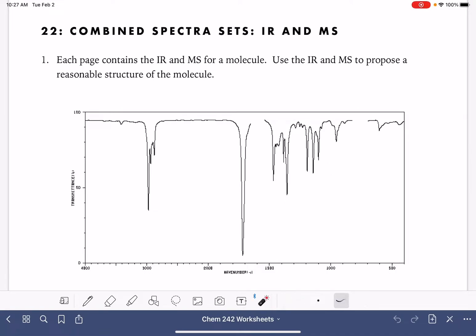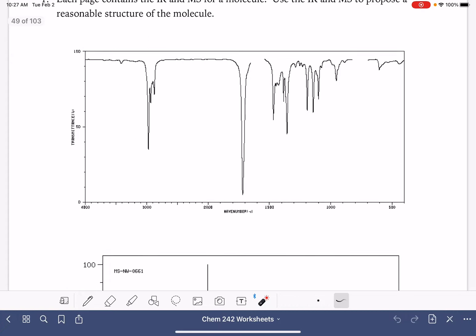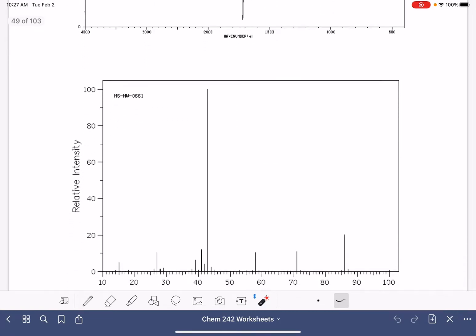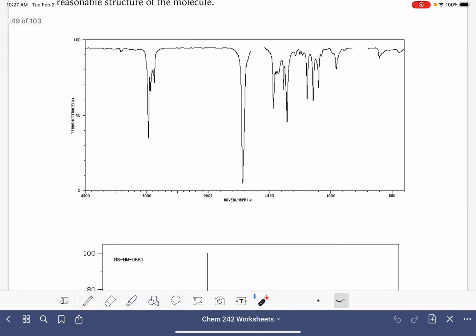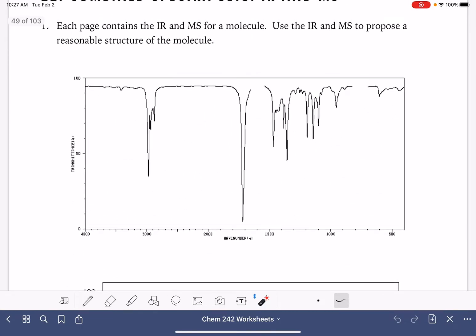Let's work on analyzing combined sets of spectra. In this video, we're going to have sets of IR and mass spec data that correspond to the same molecule — we have an IR and a mass spec, and they both correspond to the same molecule. We're going to come up with a reasonable structure for the molecule.